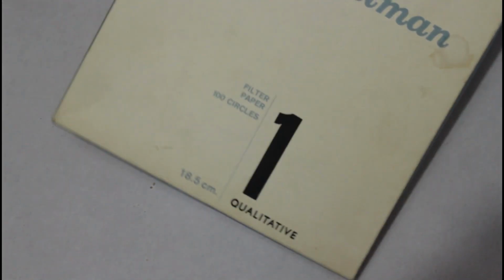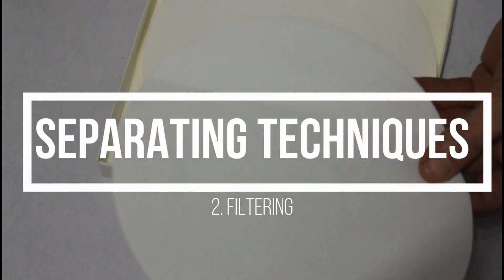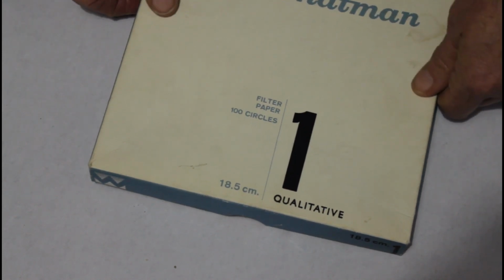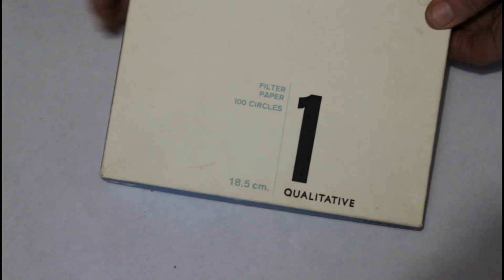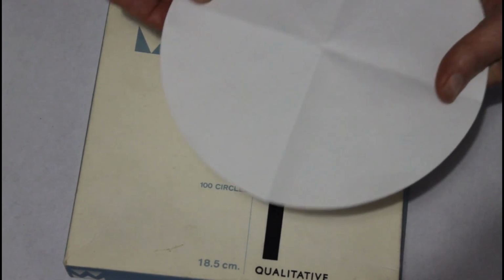This is scientific filter paper. This filter paper comes as big circles. It is very expensive because these are called Whatman #1 circles. They have got a grid, even though it's not like a coffee filter where the filter is of any size. These are a very specific size grid that's inside the paper. And you have to learn to fold it properly.